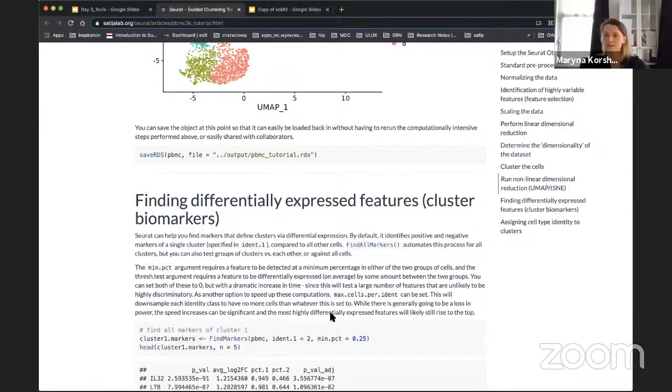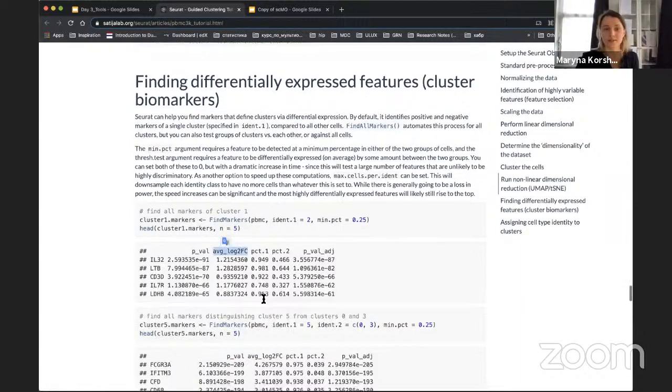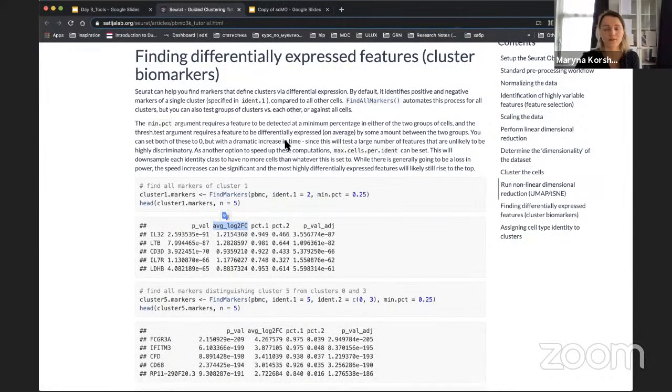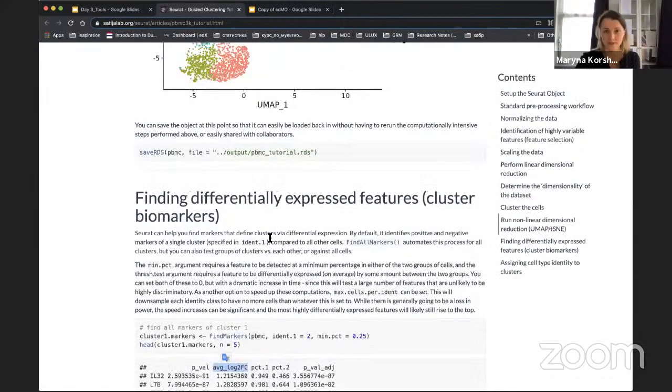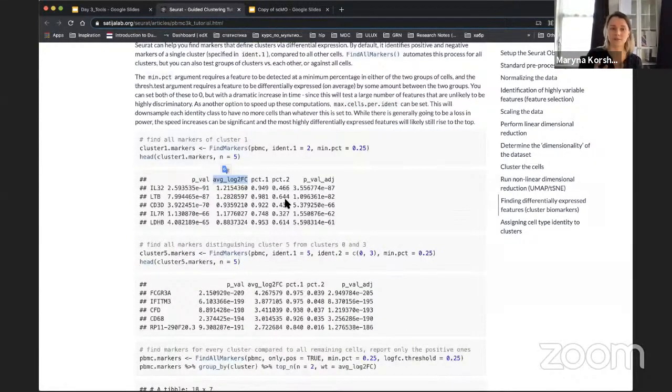Yeah, and to talk about the metrics, because manually picking genes and inserting them into different tables, with columns related to cell clusters, is a quite time-consuming process. So you look into different statistical metrics. By working with your data set, on the linear or non-linear dimensionality reduction step you generate a new data representation with already normalized, scaled, and processed data. And how do you understand if a gene is expressed in a particular cluster?